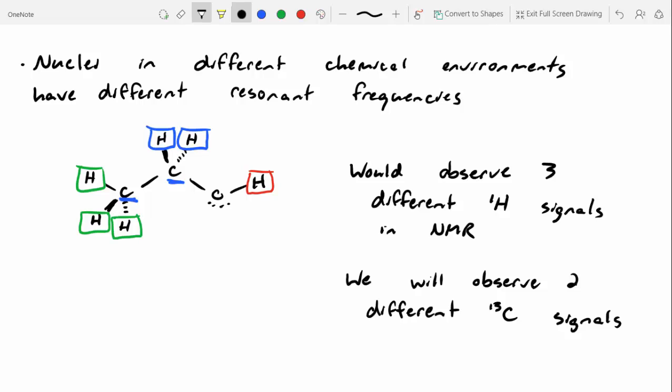How do you know the carbon is certain? Because NMR can only see odd number of protons and neutrons. That gets into complicated physics. Yeah. Does that make sense?